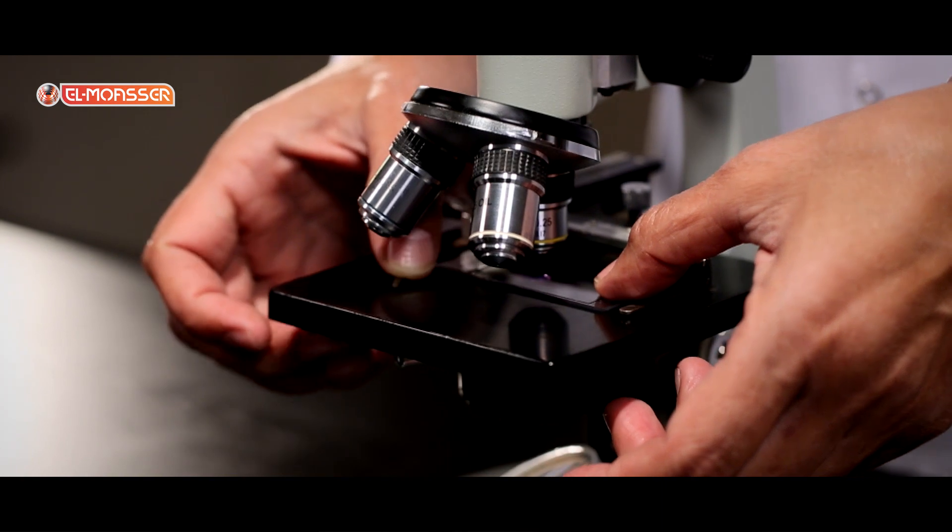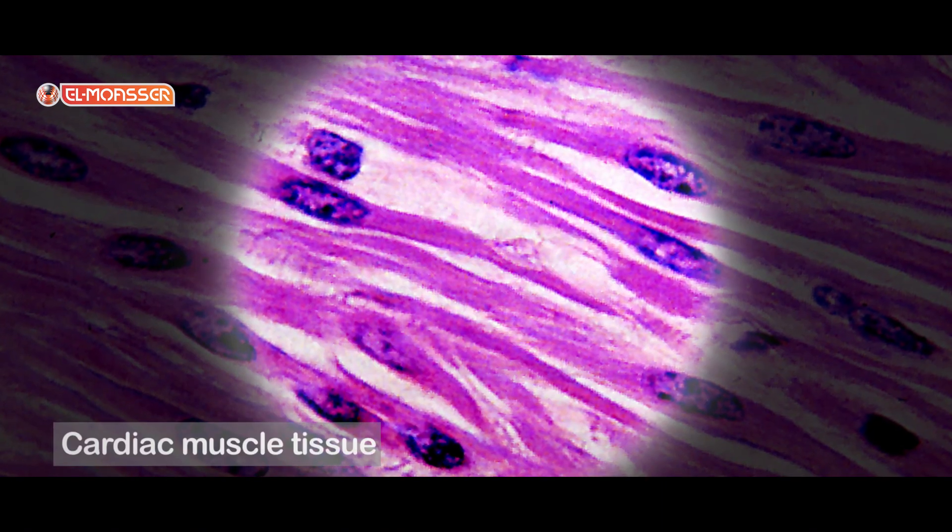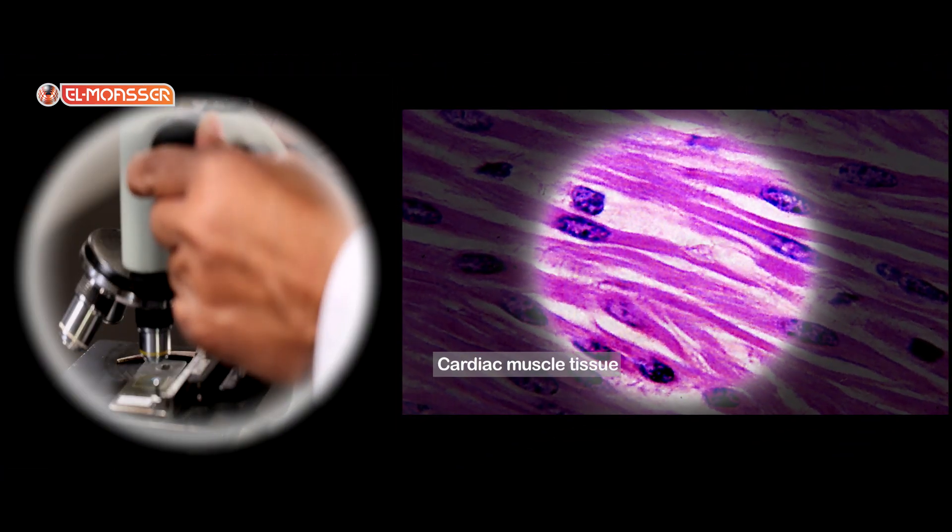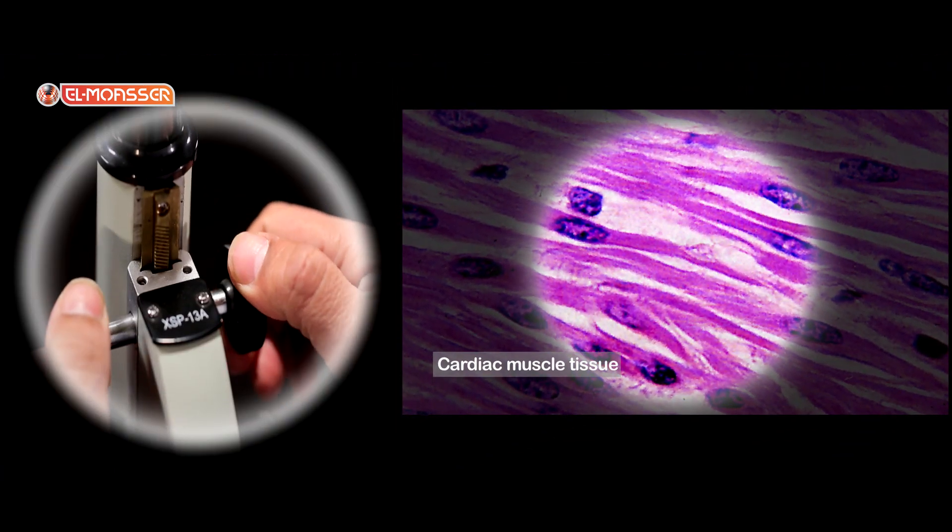Place the fourth slide on the stage. This is a cardiac muscle tissue section. The cardiac tissue is composed of branched fibers with a large nucleus.